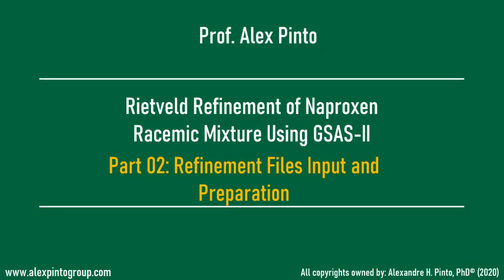Rietveld refinement of naproxen racemic mixture using GSAS-II. Part 2. Refinement files input and preparation.